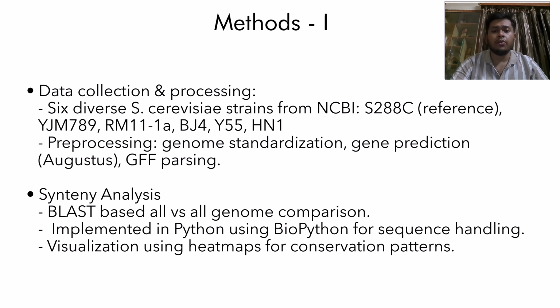For synteny analysis, we performed a BLAST-based all versus all comparison of genomes. BLAST, which is also known as Basic Local Alignment Search Tool, allows us to identify regions of similarity between sequences, which is the foundation for detecting syntenic regions. We set specified parameters including an e-value threshold of 1e-10, which controls the stringency of the matches, a minimum alignment length of 100 base pairs to ensure substantial similarity, and a minimum identity of 75% to focus on well-conserved regions.